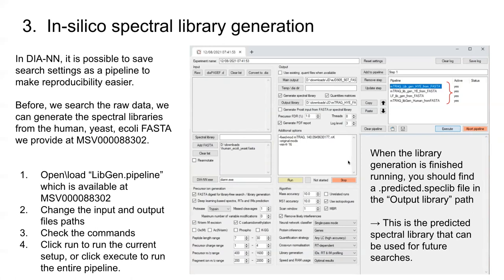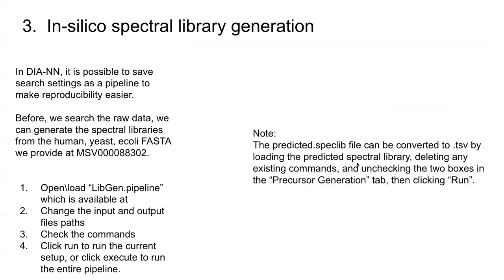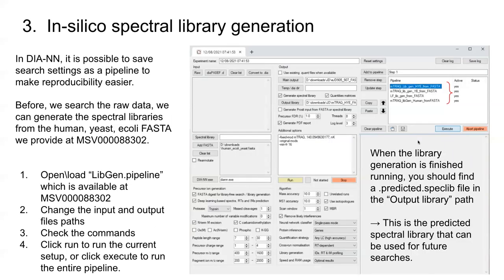Maybe you're not sure what happened with the library you made, or maybe you just want to check. One way to do this is to convert it to a TSV. If you had this library that you just generated and wanted to convert it to a TSV, you should delete everything in this command line, uncheck these boxes, change the file path, and add in that predicted .speclib you just got. It's going to read that in and convert it to a .tsv, output to whatever file path you specify. Then you could just open it up in Excel to check.